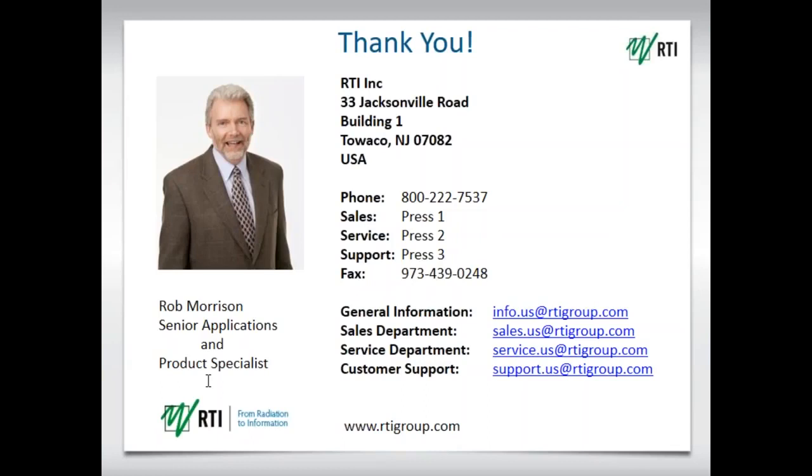Good. Another question that we had is, what kind of support is available for Ocean Professional users? Well, number one, there's a complete help index on the software itself, which covers the complete manual, as I noted in the video. And if people need more intimate support, they can email us at the customer support email, or they can call us directly. We're here from 8:30 to 5 Eastern Standard Time to help people out with any of the needs that they may have support-wise.